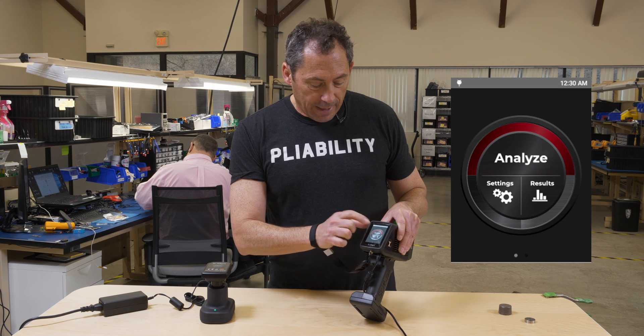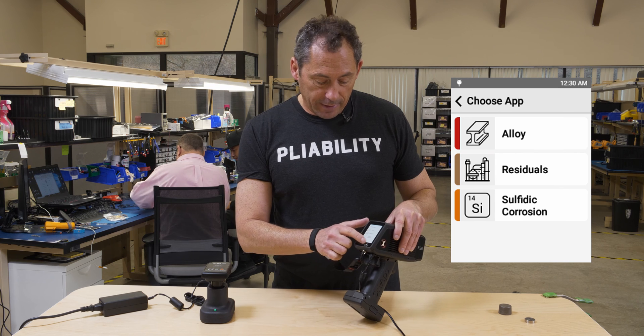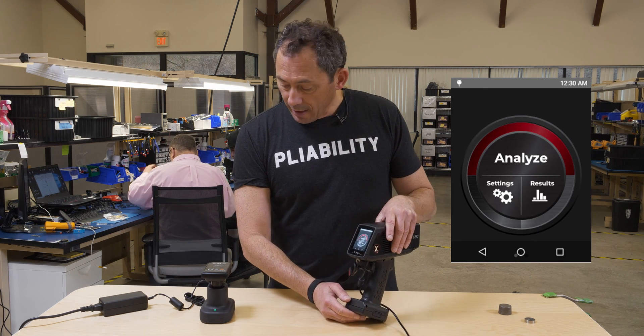You fire it up, tap Analyze, choose whatever alloy you're going to test, and off you go — you're ready to test. You swipe up and hit that to get back to your home screen, just like on your Android phone.